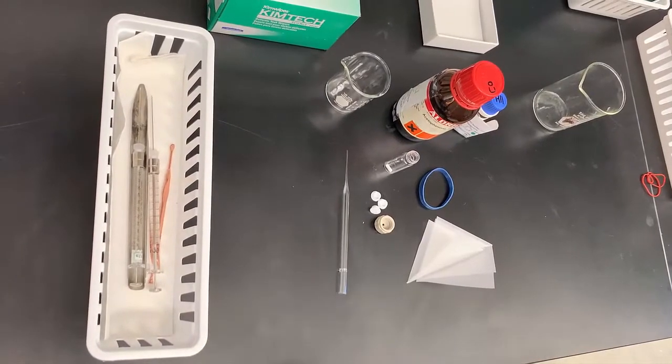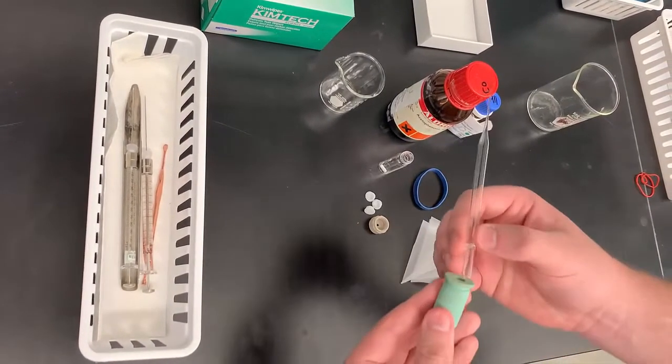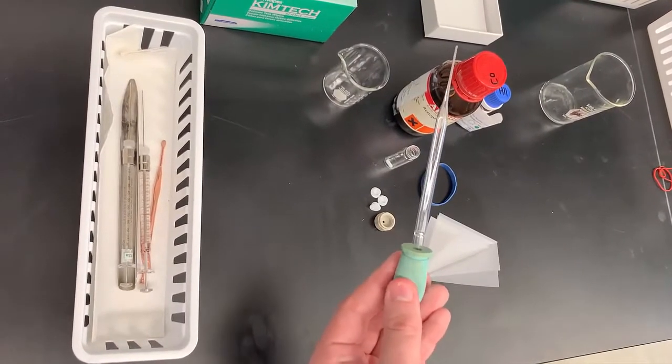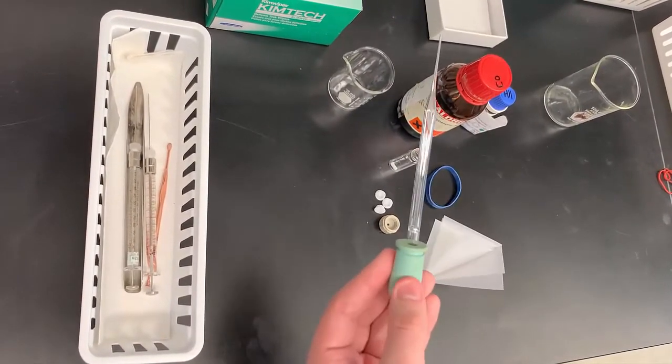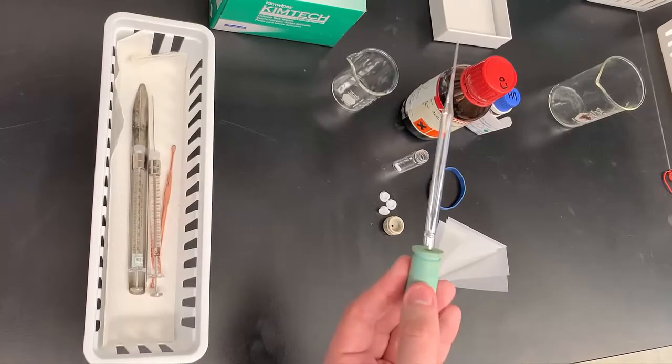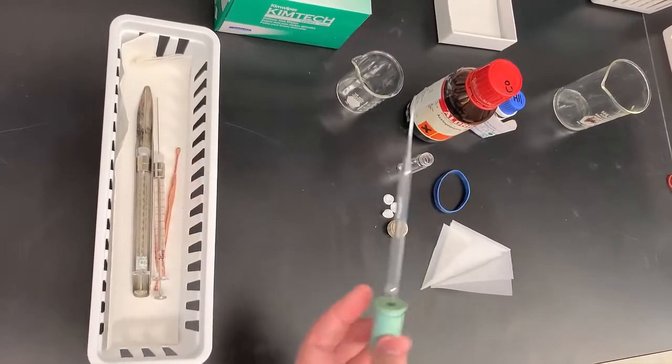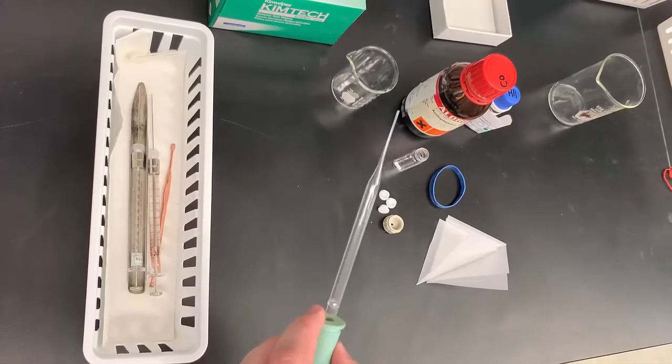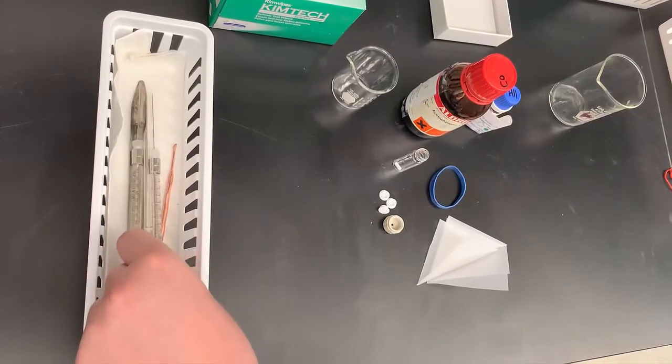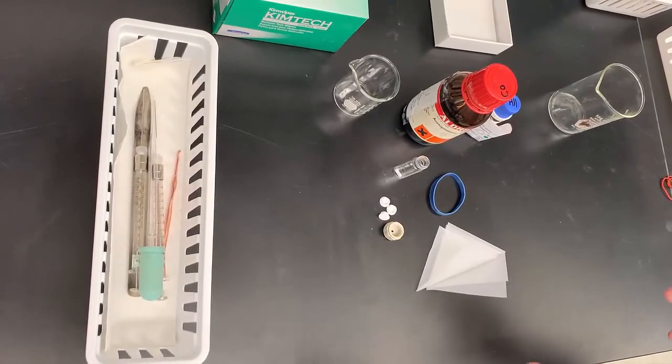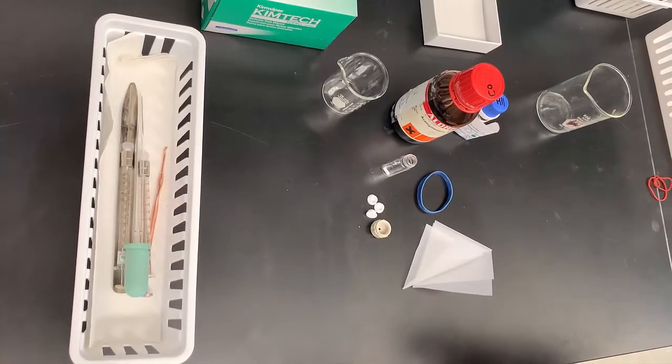You will need a Pasteur pipette with a bulb, which you can put together before entering the glove box. This is used to dispense our toluene and one large bulb is usually all you need. Make sure that when you're putting things in the basket, all things with sharp ends are pointing the same direction so that you know which direction to retrieve from the glove box.